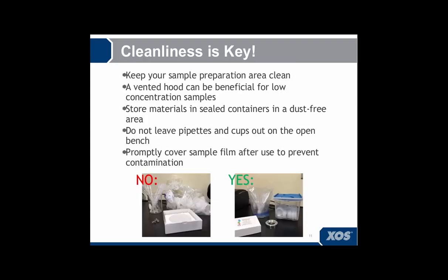First of all, cleanliness is key. This is obviously common sense. Basically, if you keep your sample area clean, you're less likely to have contamination. You can use a vented hood to help with this. But basically, store materials in sealed containers in a dust-free area.